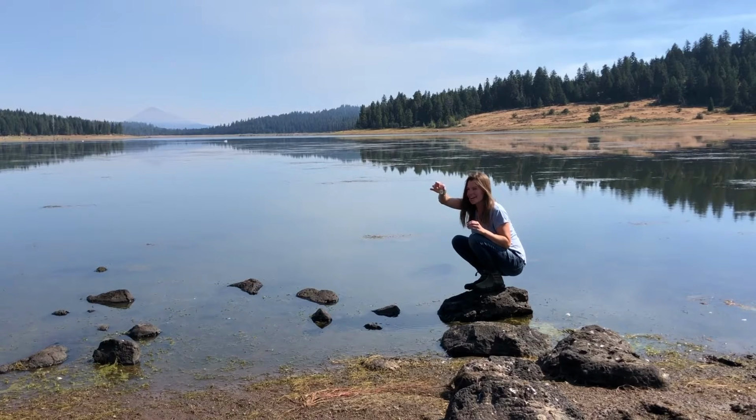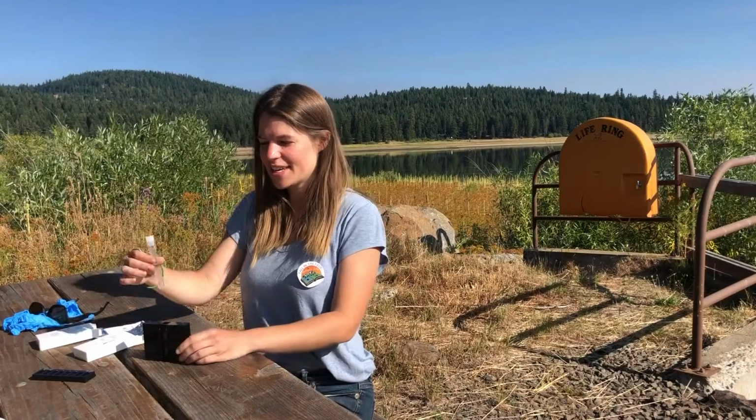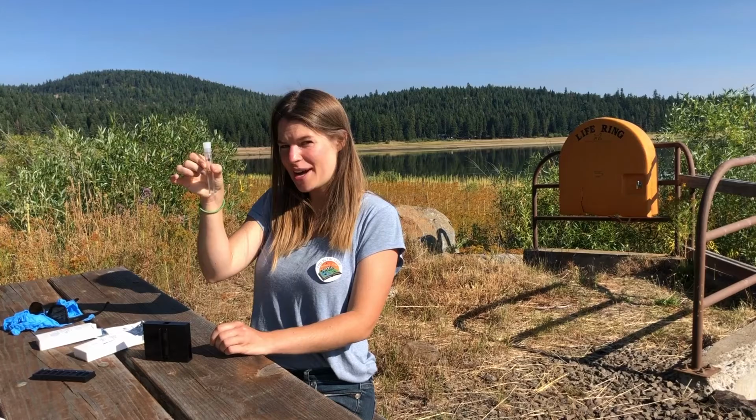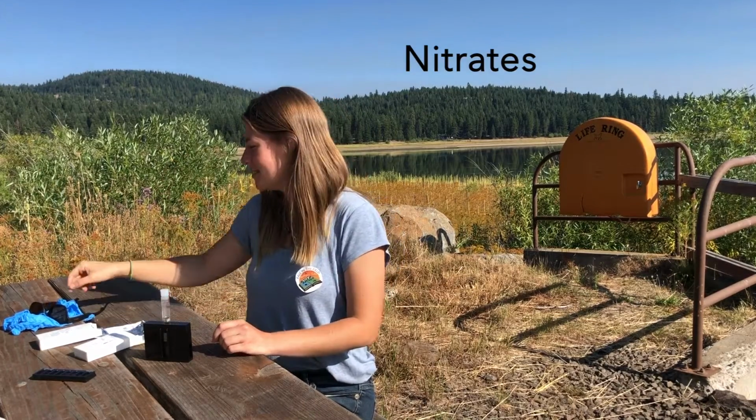Nice and clear without any mud. That looks perfect. Now that we collected our sample of water from Hyatt Lake, it's time to test it for nitrates. First, I need to put my safety gear on.